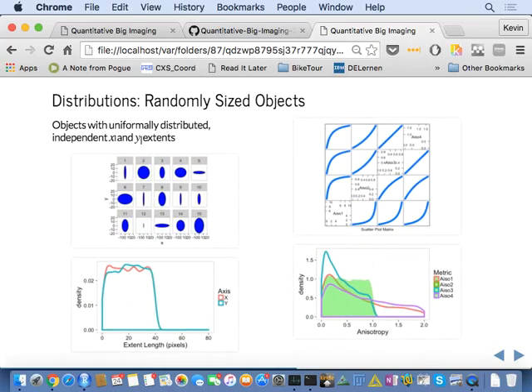So those are the factors that you use to pick which one of these terms makes the most sense. Because ultimately, once you've decided on this metric for anisotropy, it will affect the rest of your results. And if it's not matched well to the system you're looking at or the experiments that you're doing, then you can get very strange or not as reliable results as you would ideally want to get in your system. Cool.